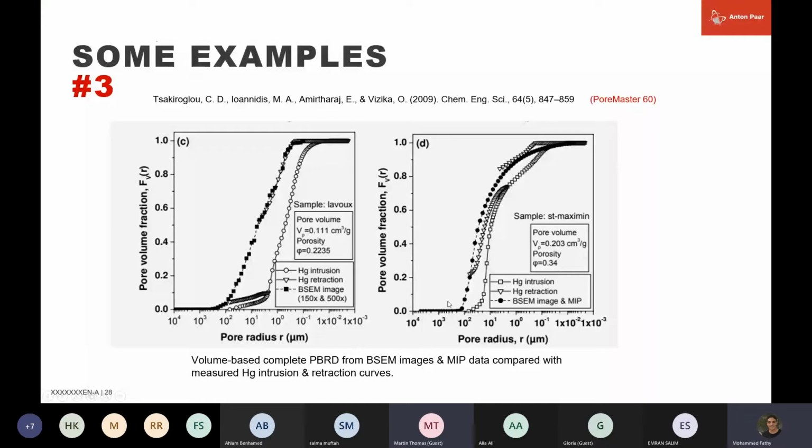But you can also intrude only to this point, set a different end pressure and depressurize from there, and you get a different depressurization curve. So you can get insight into the pore structure by intruding only partly or completely or anything in between.